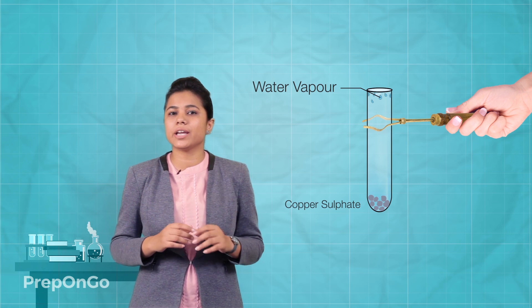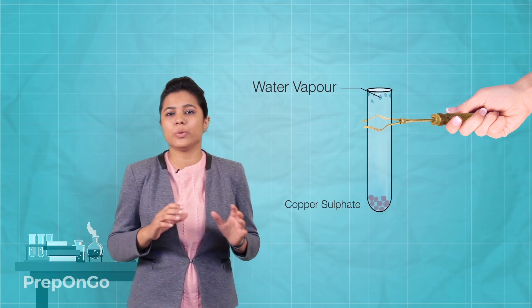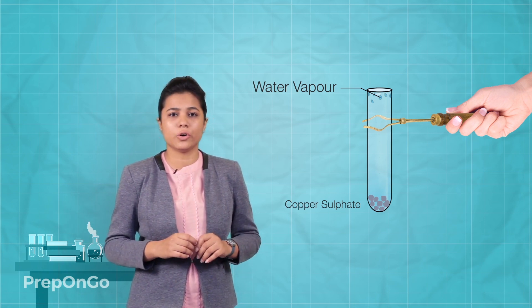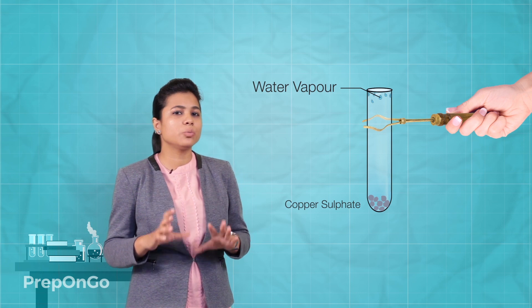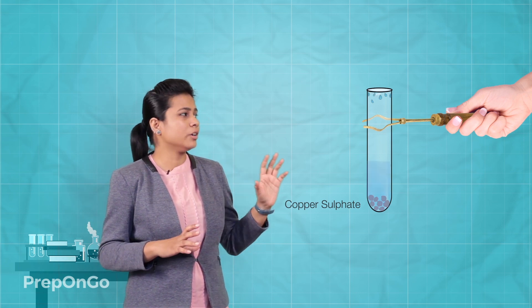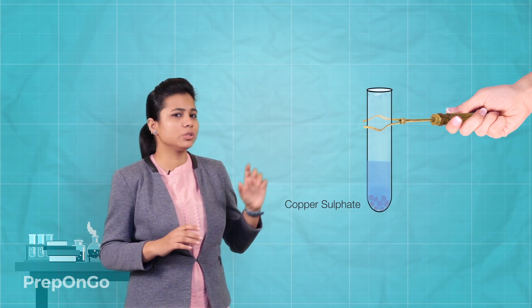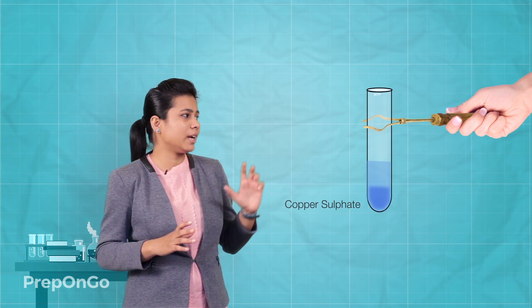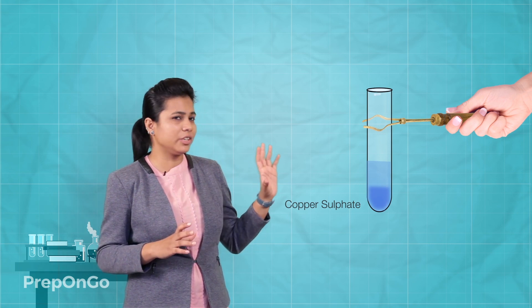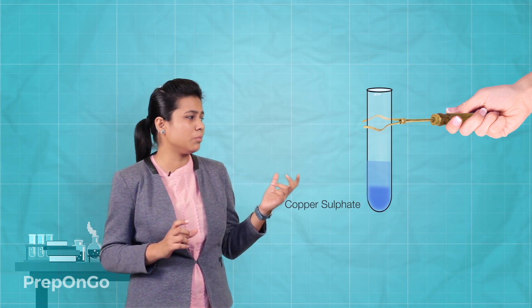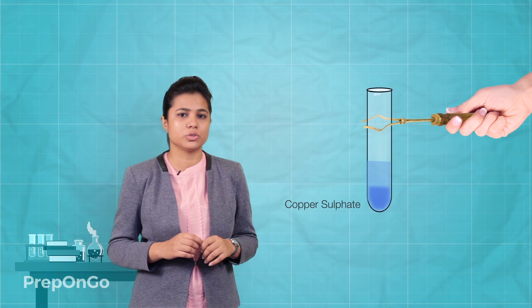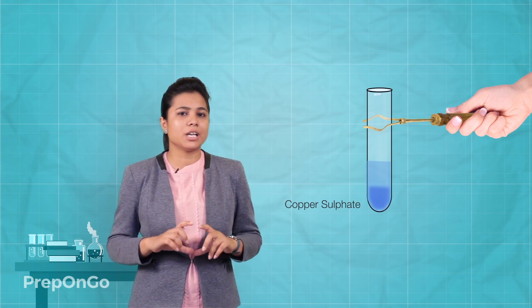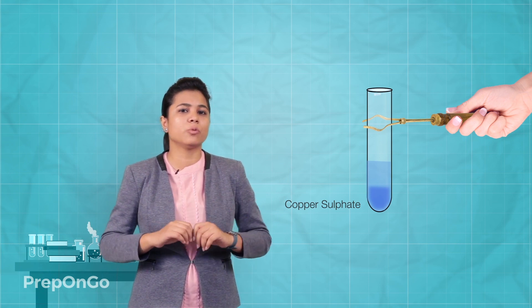Now we have to verify our conclusion — whether water molecules are present in the salt or not. So we are going to add water again to these dried crystals. You can see that the color has been regained; it has again become a blue color solution. So we can say that the copper sulphate had some water molecules.